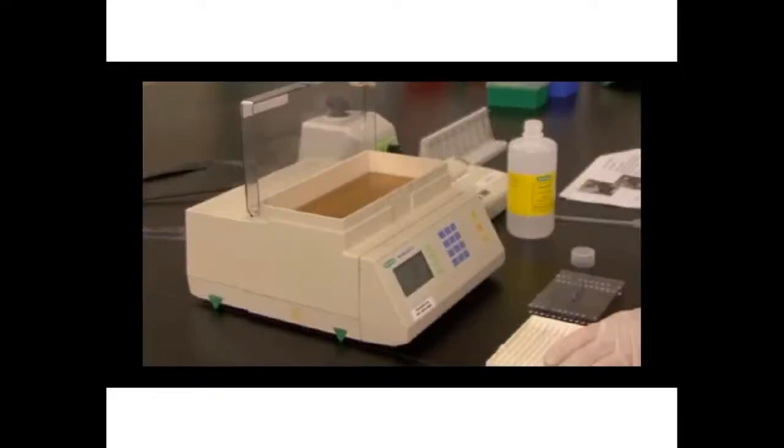Place the focusing tray into the protein IEF cell, making sure to align the positive electrode of the focusing tray with the positive electrode of the protein IEF cell, and add enough mineral oil to cover the strip in each lane. The purpose of the mineral oil is to prevent the strips from drying out during the course of the rehydration and the run. Now I am going to program the protein IEF cell.